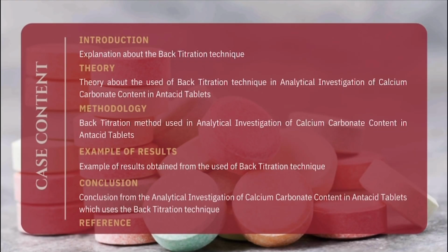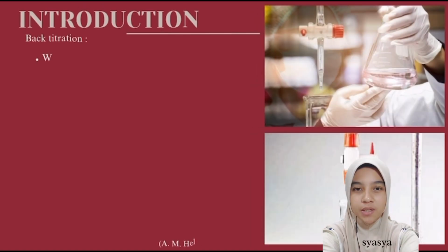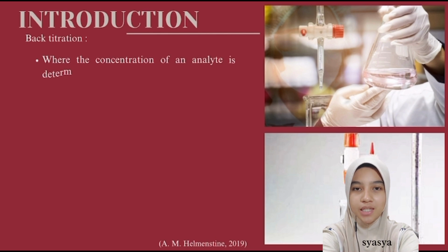Here is the list of the content that we're going to talk about in this video. Now I will explain the first part of the video, which is the introduction.